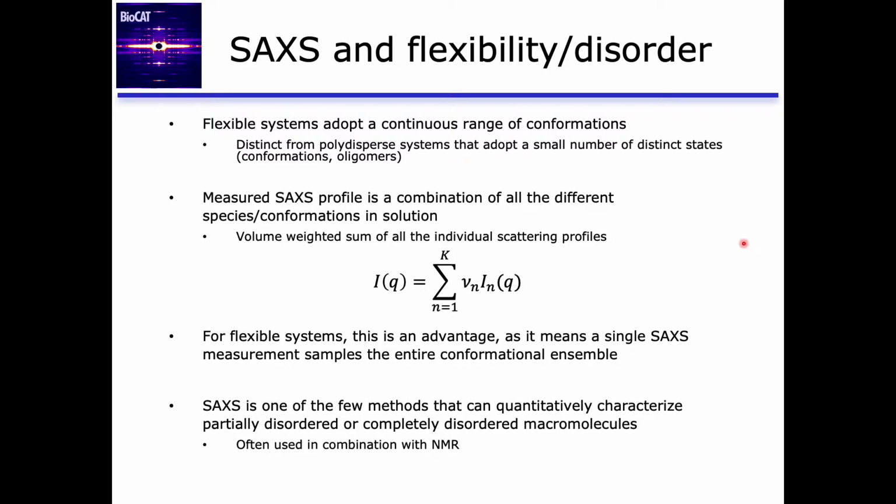Additionally, I'm going to use the terms flexibility and disorder kind of interchangeably in this talk. You can argue if they're the same or not, but flexible regions tend to be disordered in a protein, disordered regions in a protein tend to be flexible.